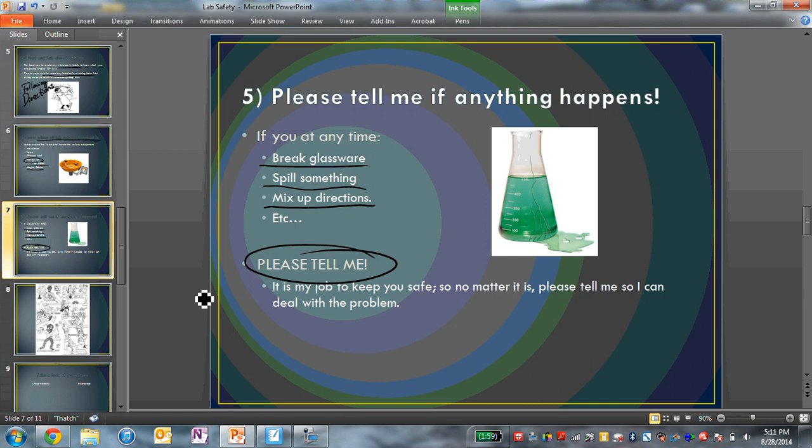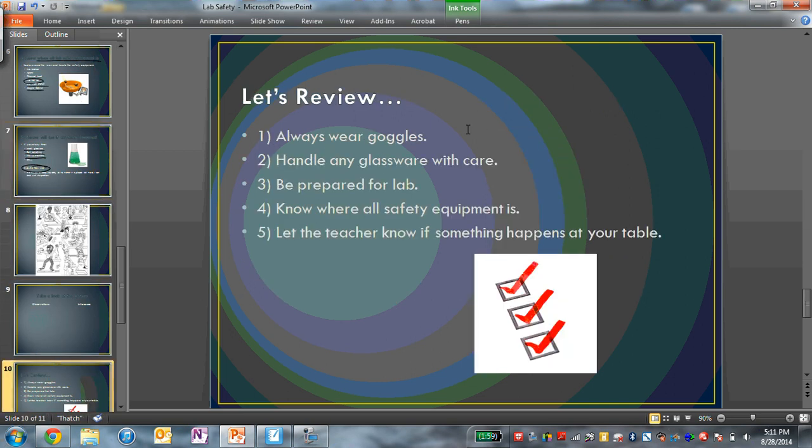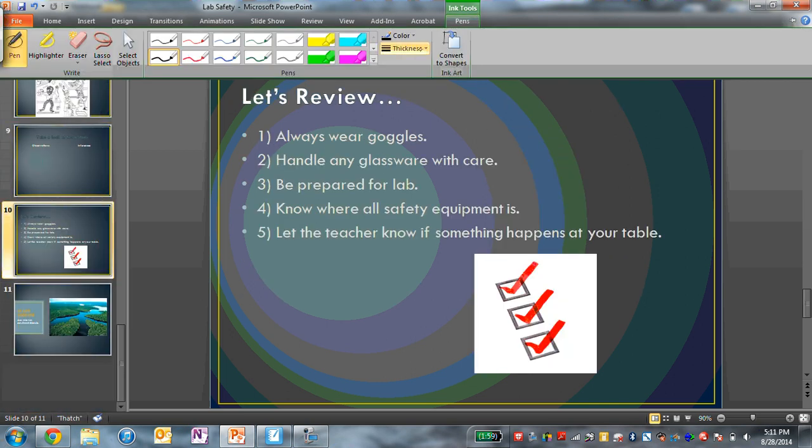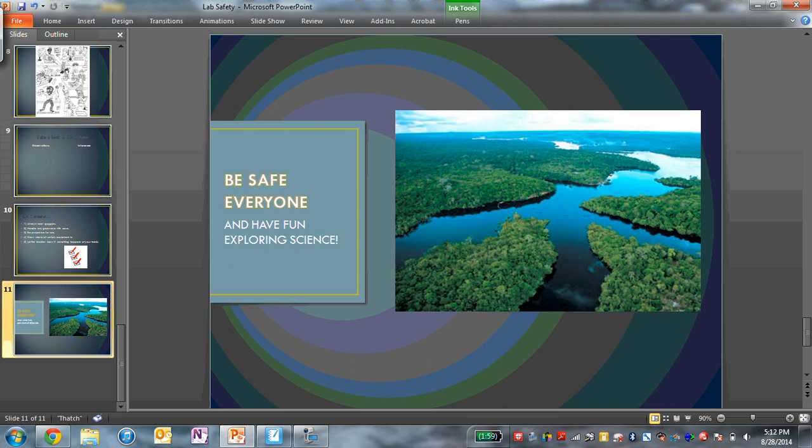Okay? So, the 5 basic rules of lab safety are: always wear goggles, handle glassware with care, be prepared, know where the equipment is, and let me know if anything happens at your table that wasn't supposed to happen. All of that can get us a safe environment and allow us to explore science in a very fun and safe way. Now that we've got those 5 rules, what I'd like you to do is take a look at this picture.